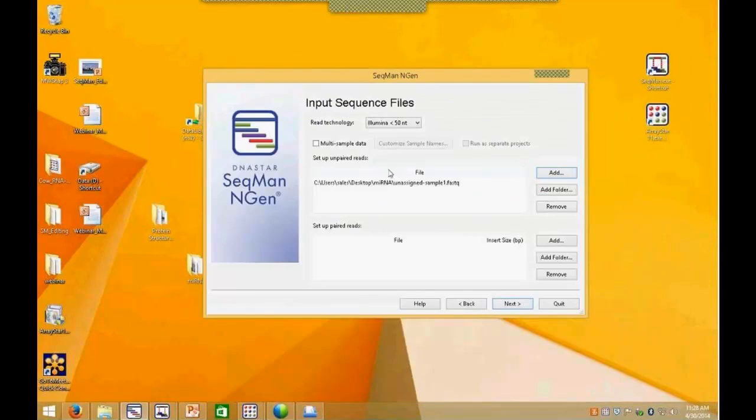And the reason for that is I don't want to throw all the data into a de novo microRNA assembly. There may be some species or some elements that aren't even microRNA, but maybe ribosomal RNA, for instance, that can be extremely abundant in the sample. And so I don't want to throw all the data in and assemble it and have a contig that is literally over 1 million sequences deep, which happens quite frequently with microRNA. De novo assembling contigs that are 1 million sequences deep is really inefficient, and so it'll make RAM spike and maybe will cause a problem with your de novo assembly.